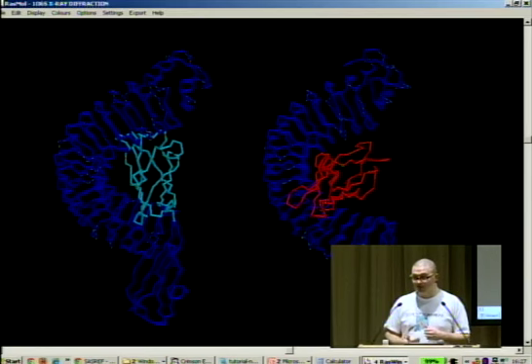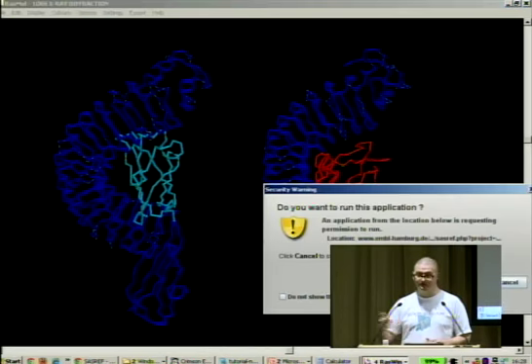So one way of dealing with that problem would be to repeat this modeling process multiple times and to see if there is some preferable orientation of the smaller protein. However, it's relatively small and globular, and probably there will be no preferable orientation. So the proper way of dealing with this problem is to find the relative orientation of the two proteins using some other methods.